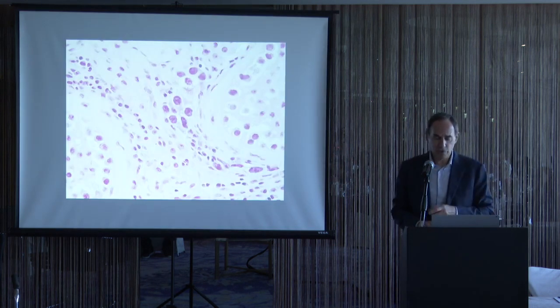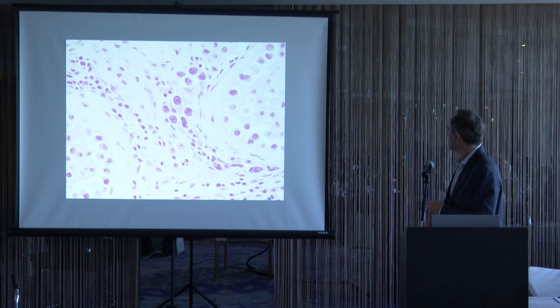So intertubular seminoma, here we see basically seminiferous tubules. Some of them have some germ cell neoplasia in situ, and then in between the seminiferous tubules are these scattered seminoma cells associated typically with a lymphocytic infiltrate, but no mass-like lesion.